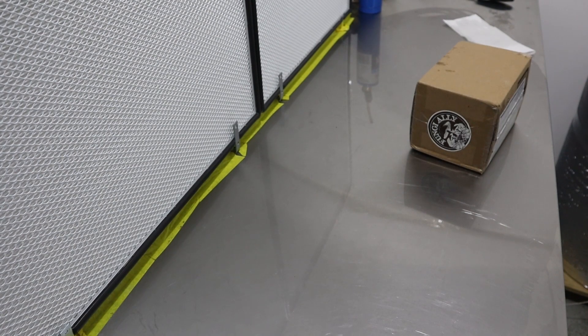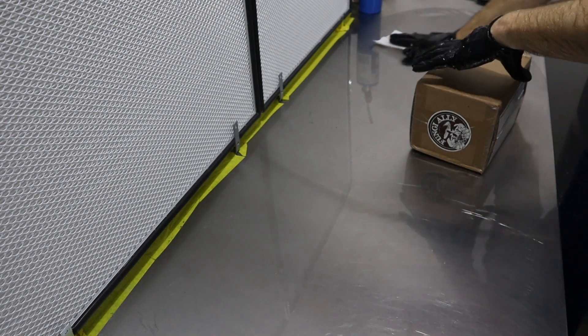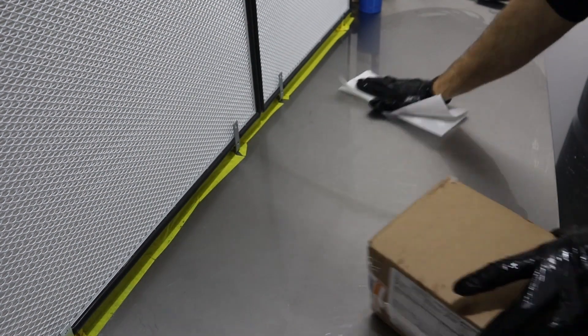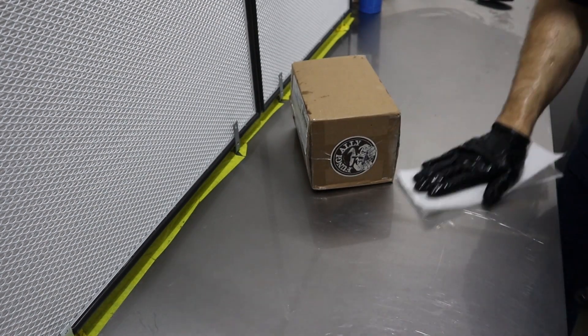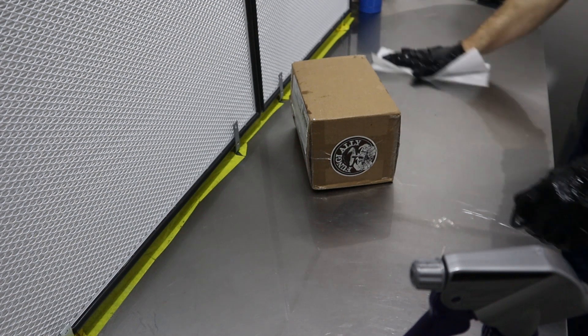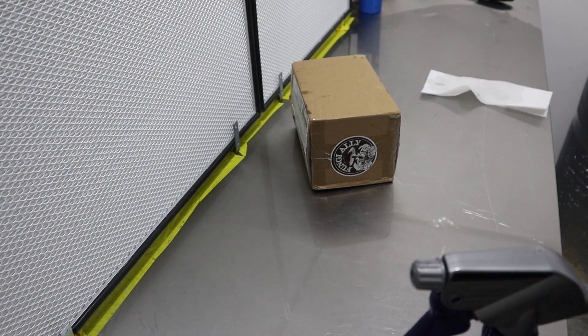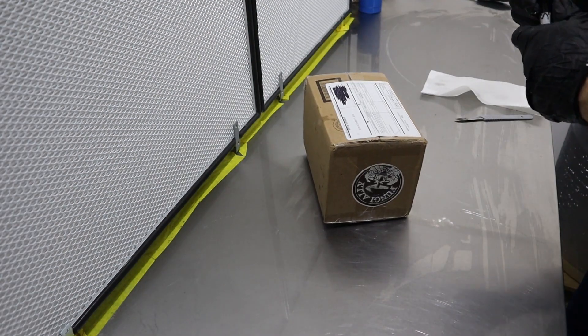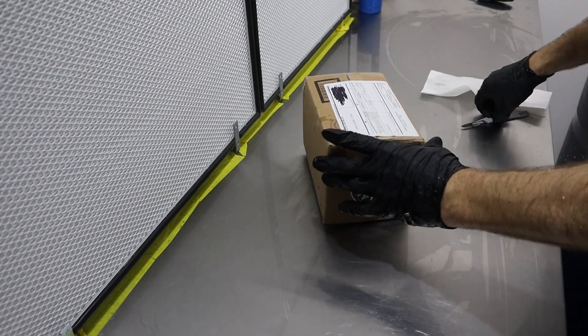Normally I'd have my flow hood on, but I don't at the moment just because it's horribly loud. We're just going to open this box, so it should be all right. The box is all contaminated, so I'll turn it on once we get this box out of the way. I'll just cross off my name so you guys can't zoom enhance it.